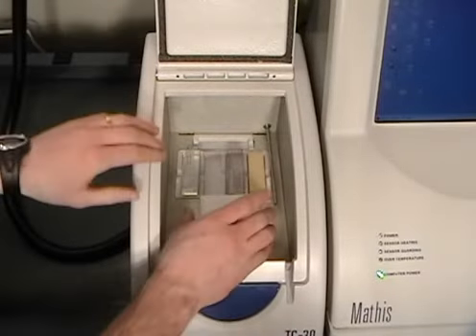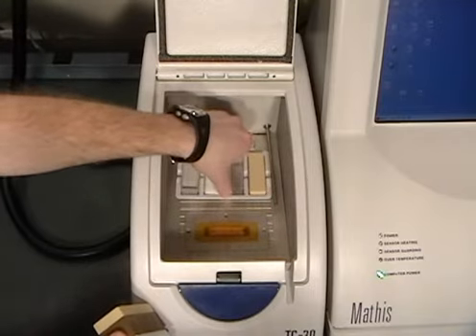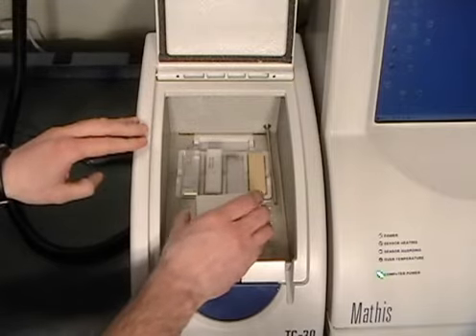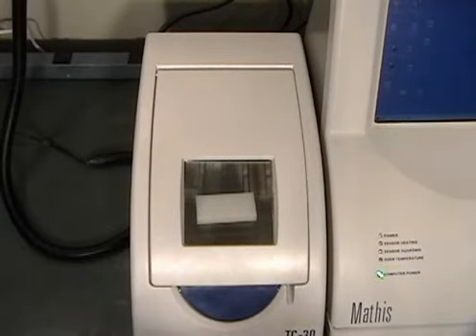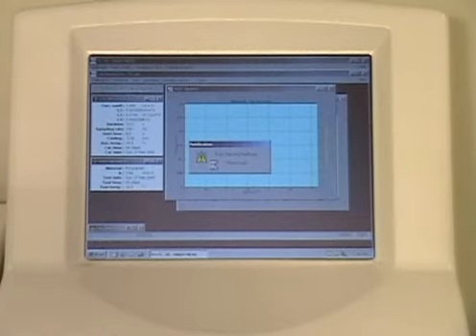Once you've selected your last reference material in the software, open the chamber lid and change your reference materials. Again, you must wait 5 minutes before beginning your next test to allow for isothermal conditions. To complete your calibration routine, test your last reference material two times for reproducibility.